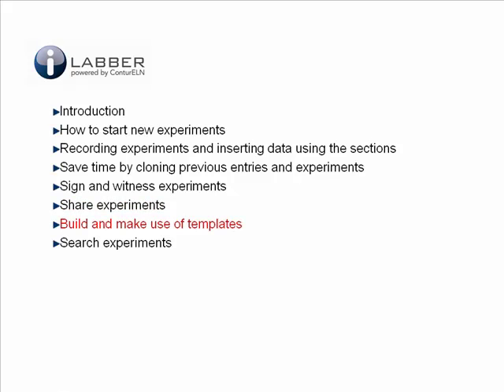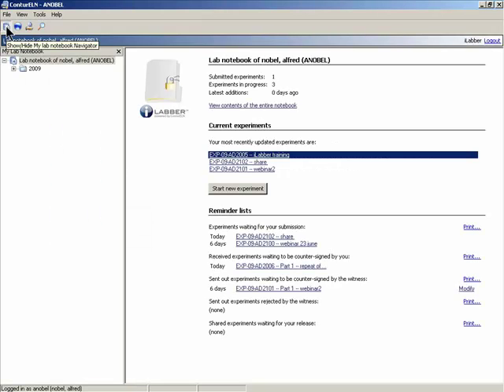So following from sharing, we'll go on and look at templates, which add a lot of structure to experiments, but also save a lot of time in producing experiments. For MyLab Notebook, we go to the third button at the top here, which is the Template Navigator.